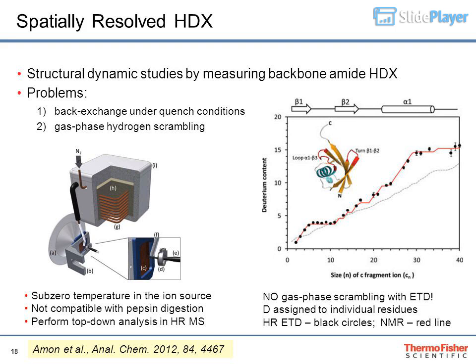Spatially resolved HDX. Structural dynamic studies by measuring backbone amide HDX. Problems: back exchange under quench conditions, gas phase hydrogen scrambling. Figure 1. Schematic drawing of the cooling device adapted to a chip-based nanoflow electrospray ionization, ESI, setup.